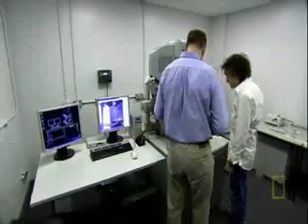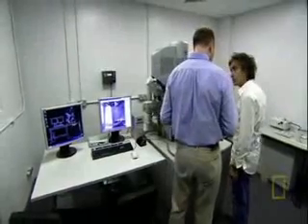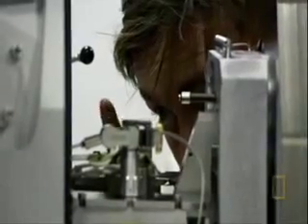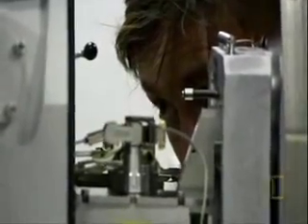Well, we can do that. Because this is a dual beam microscope, we have an electron beam that comes down here that we use to look at the sample. And over here we've got an ion beam which we use to cut away the sample with great precision. Ions are electrically charged atoms. They can cut stuff atom by atom.